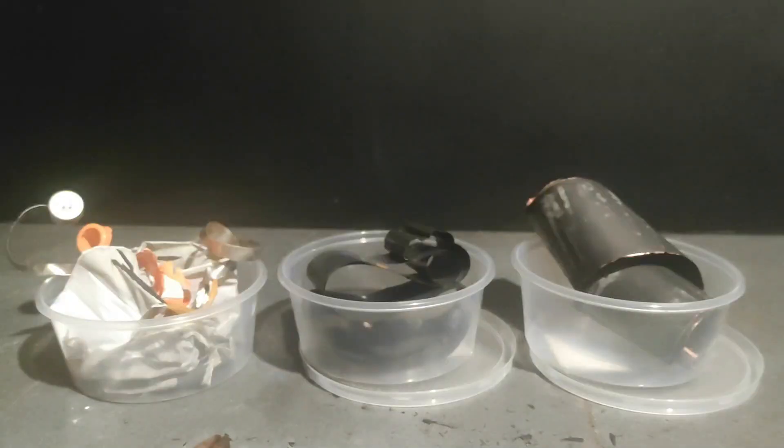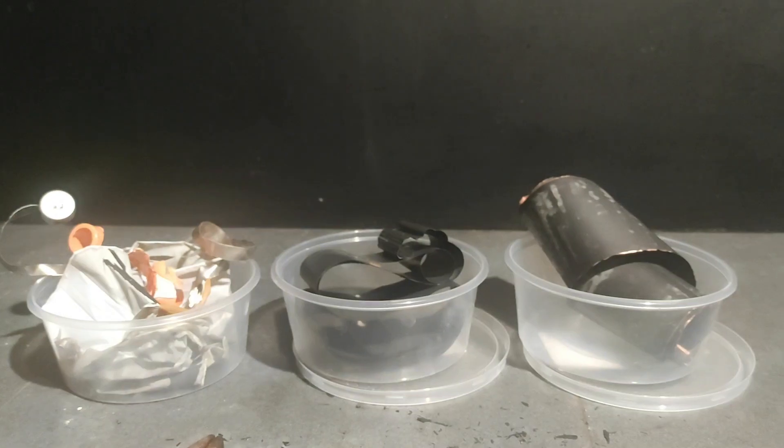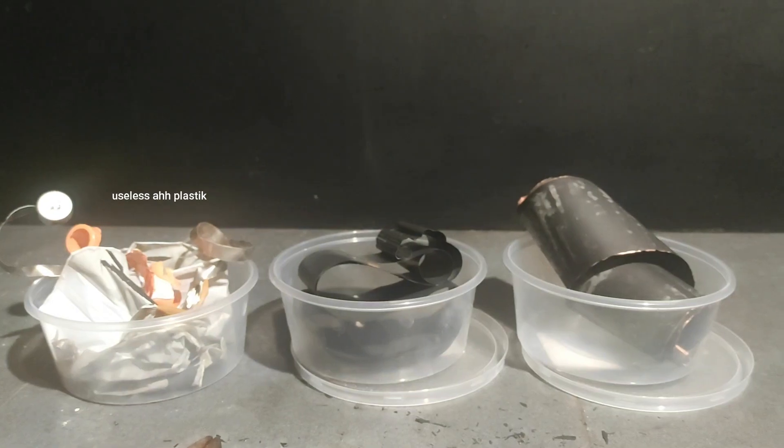After we dismantled everything, we have three main components. On the left is the useless plastic junk, and you can throw that away because it's safe to dispose of and it never touches the more toxic metals inside, like the cobalt or the lithium. The second cup contains a sheet of aluminium covered in a black material that contains our precious cobalt and other stuff as well. And on the right is another sheet made out of copper and covered in carbon. All of this is usually soaked in a weird solvent that is not good for your health, so it's better to wear gloves when handling this stuff.